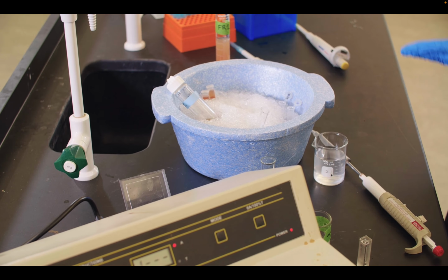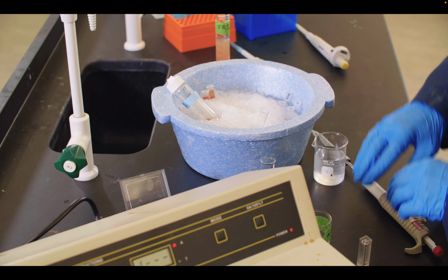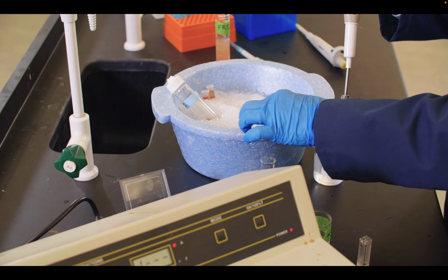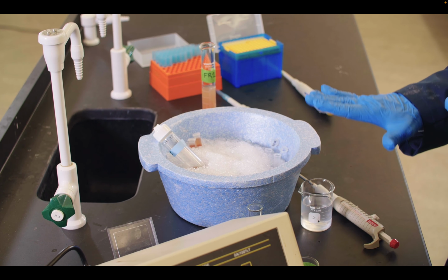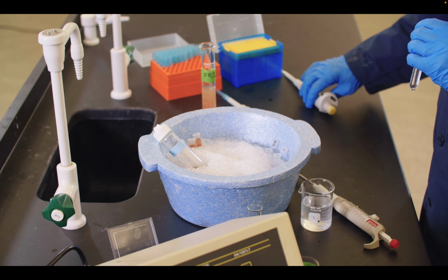All right, so an assay really is going to test for an enzyme, and so we're going to test for the presence of GOT. How are we going to do that? Well, we're going to have 2.5 milliliters of our buffer. We're going to put that into a test tube, along with a couple other components. So we have our buffer, and this is the phosphate buffer, pH 7.5, which has aspartic acid in it. That's to help select for the GOT.